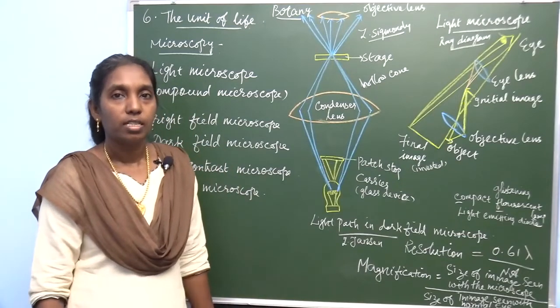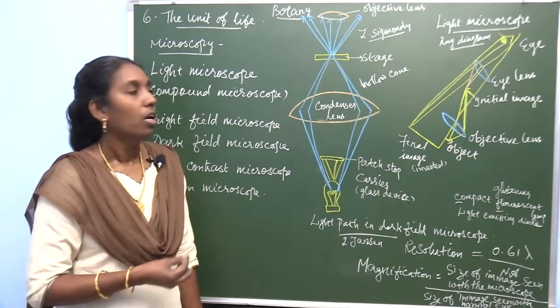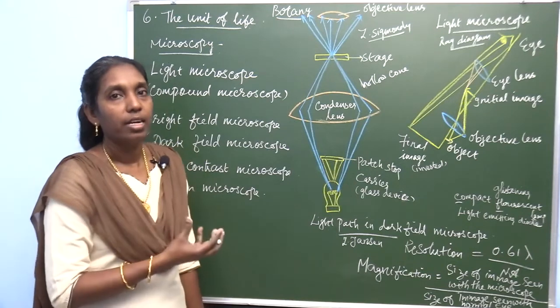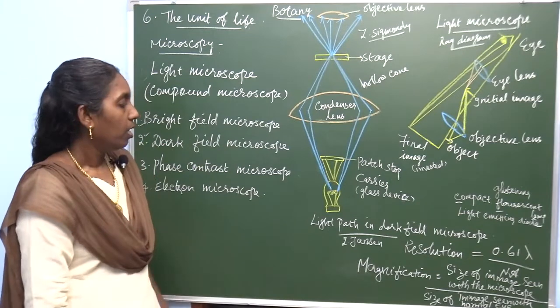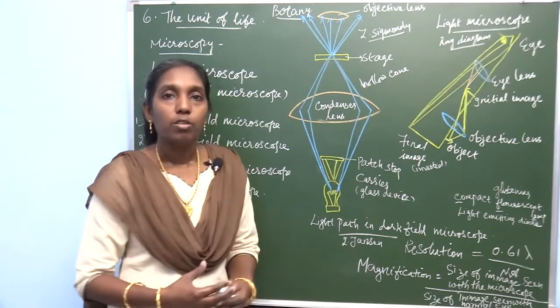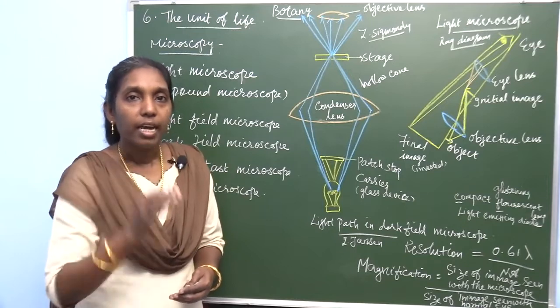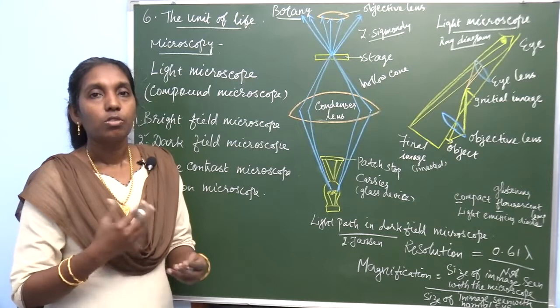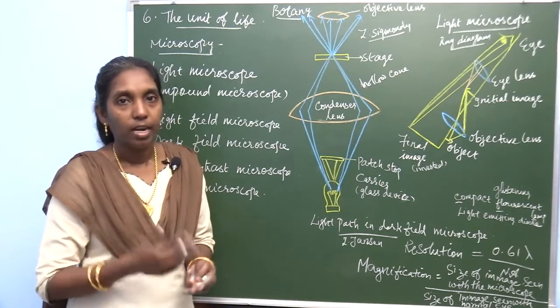Almost all cell structures, and structures like the ovule, we commonly identify under this type of microscope. This microscope functions with the image directly focused by light, using a source of light.